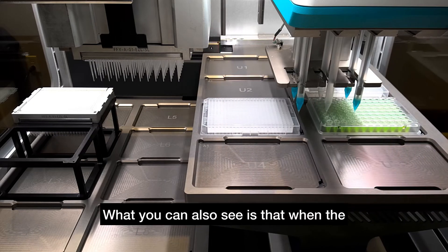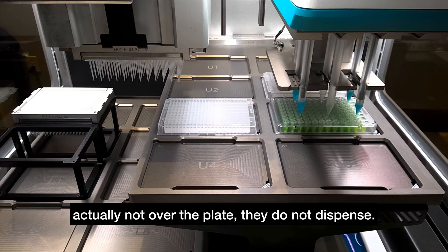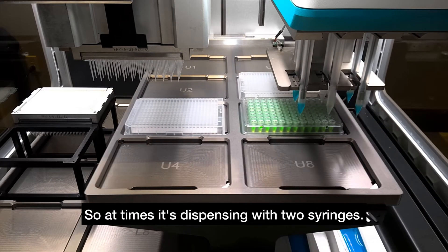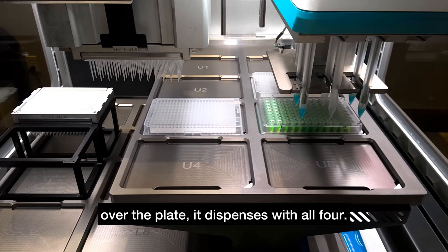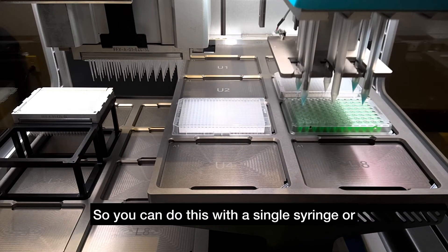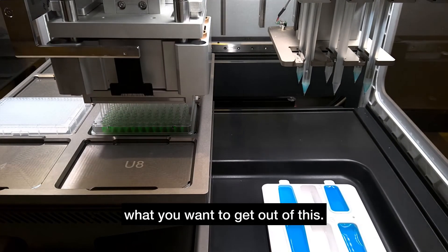What you can also see is that when the two syringes on the left or the right are not over the plate, they do not dispense. At times it's dispensing with two syringes, and when all four syringes are over the plate it dispenses with all four. You could do this with a single syringe or two or three or any number depending on what you want to get out of this.